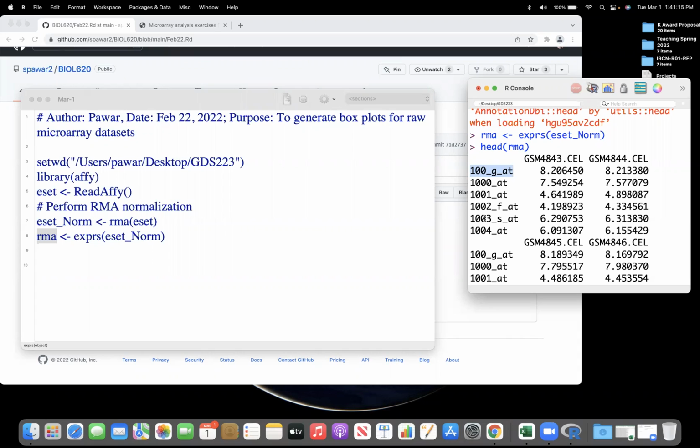Are we clear? No. So okay. So these IDs match to genes. Every ID is one gene, but that information is not present here in the chips. Chips are very specific to these platform-specific identifiers.